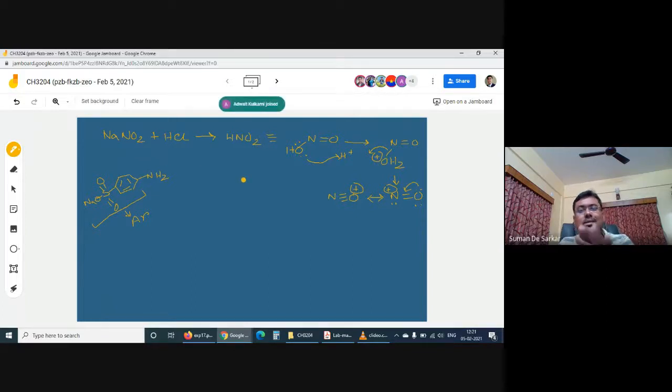HCl is rather okay, in some dioxane or so. You can manage HCl, but NaNO2 will not be, it's a pure inorganic salt. But by just making a salt, we can dissolve this one. Because you are doing a reaction between an organic reactant and an inorganic thing, it's better to choose one solvent, and in this particular case it is much easier to make it soluble in water. Also, water is greener and cheaper compared to organic solvent. So if there is an option to do it in water, better to go for water.